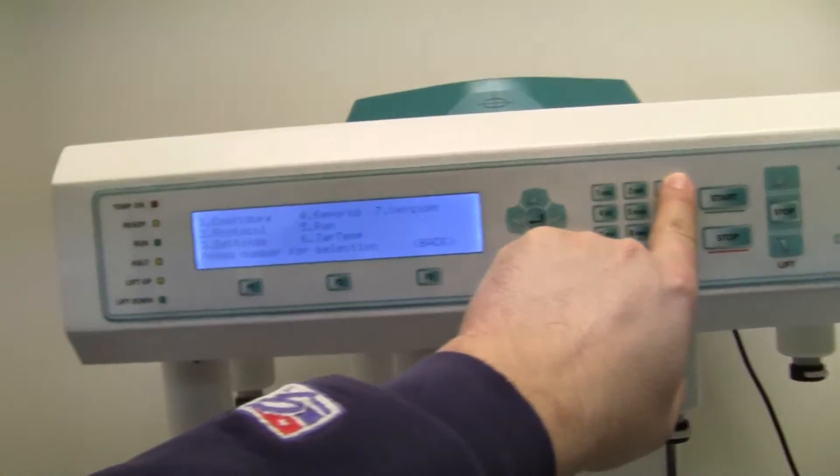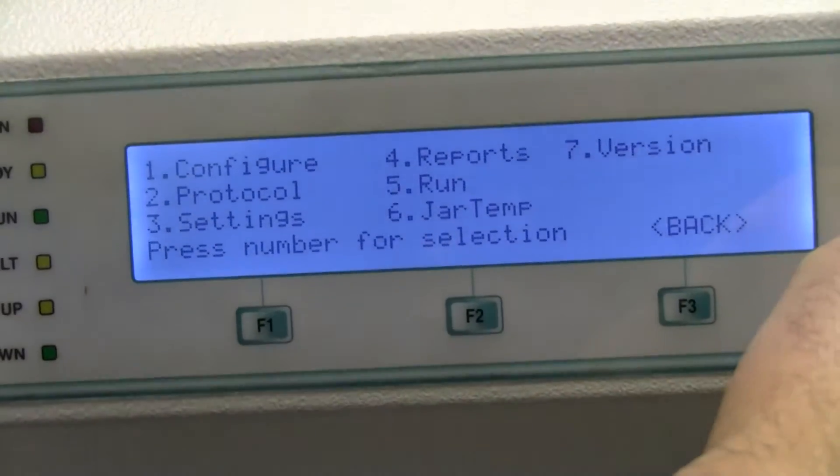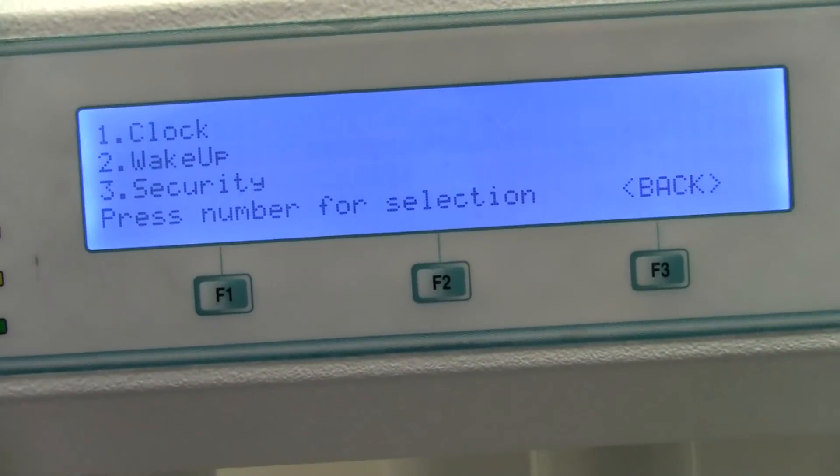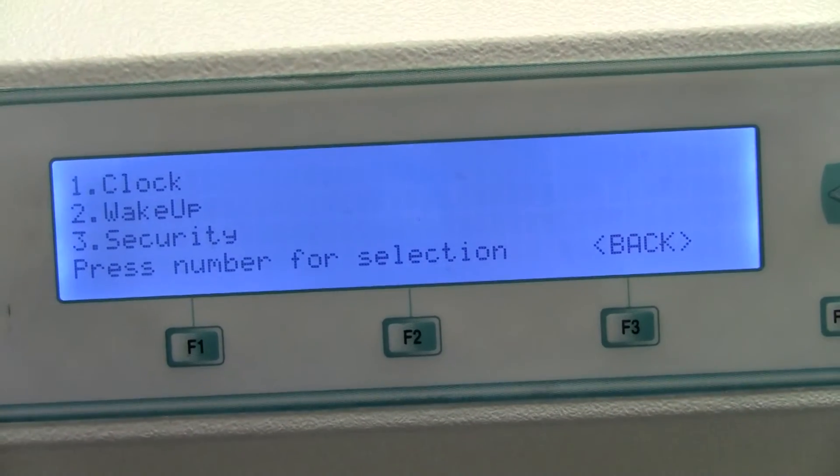It also has, as I play with the settings here, a security protocol that can be put in place so that no one fools with the method.